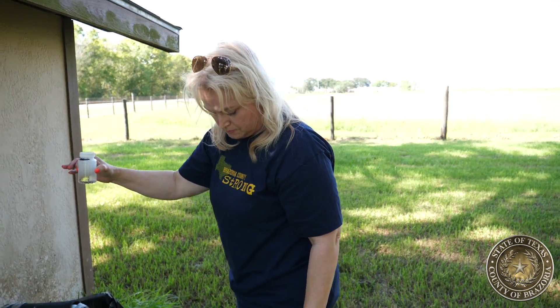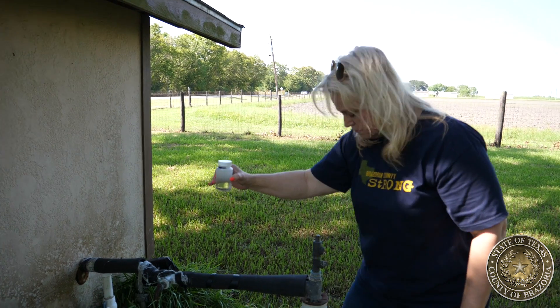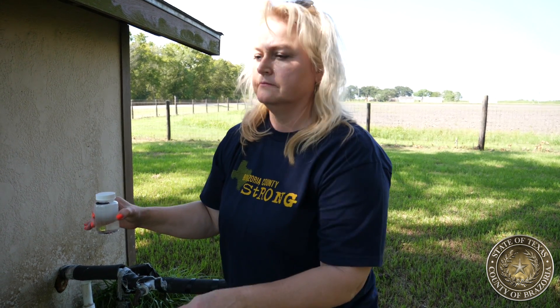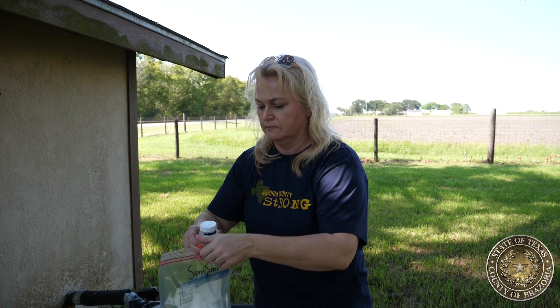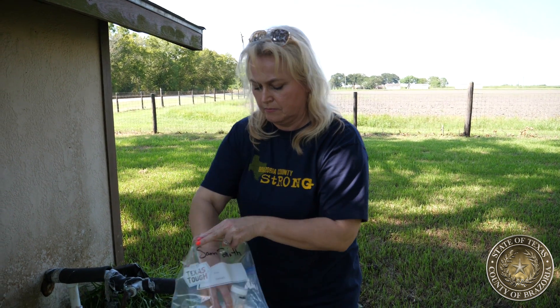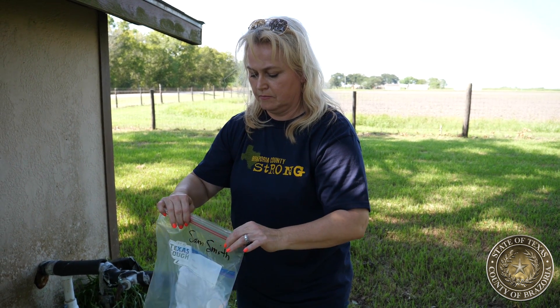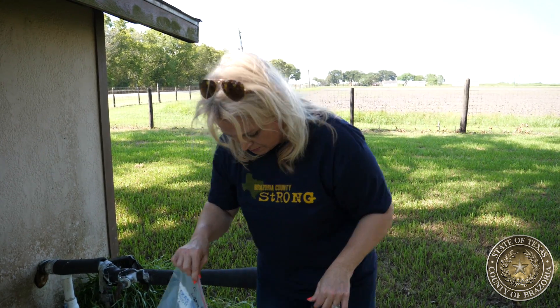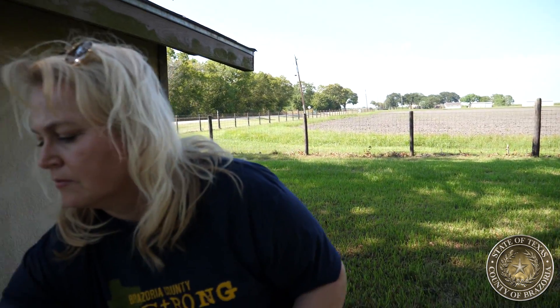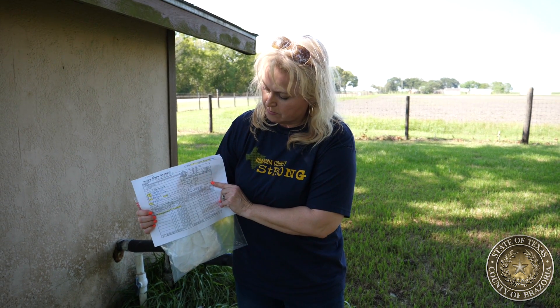When you've collected the sample, it should be delivered to the water lab within 24 hours. Place the sample in a ziploc bag that has some ice or an ice pack inside. On the outside of the bag, write your name, address, and the physical address of the well. There's also a form you'll need to fill out to present to the water lab staff, and if you need assistance filling it out, there will be someone at the lab to help you.